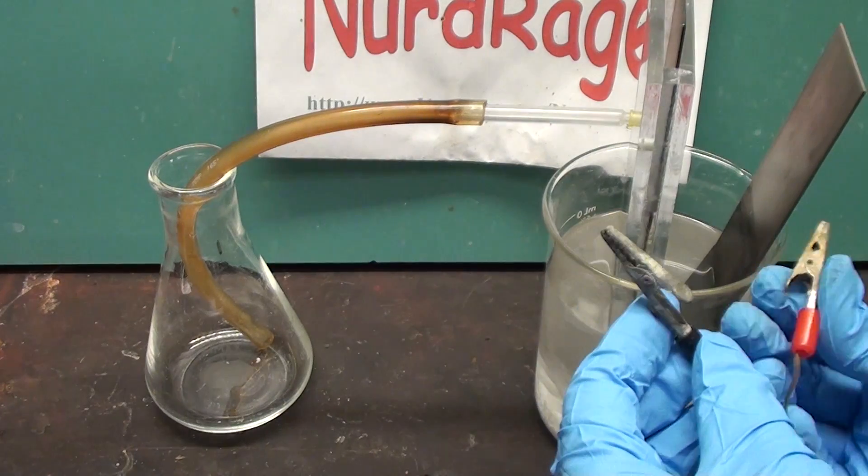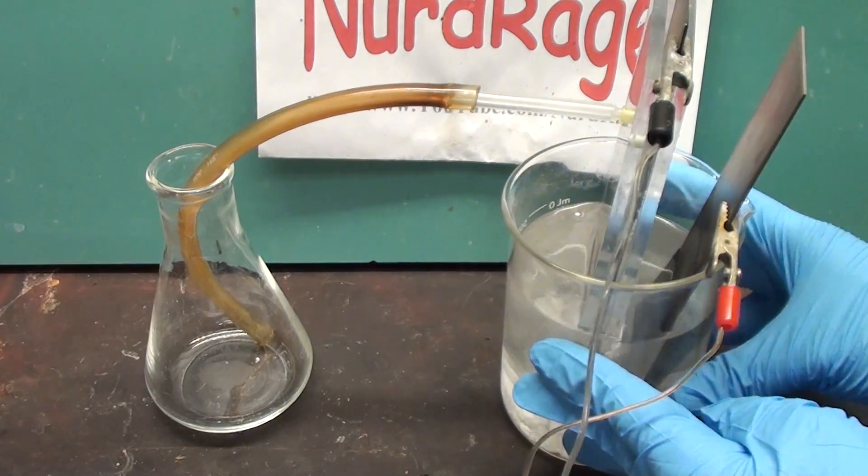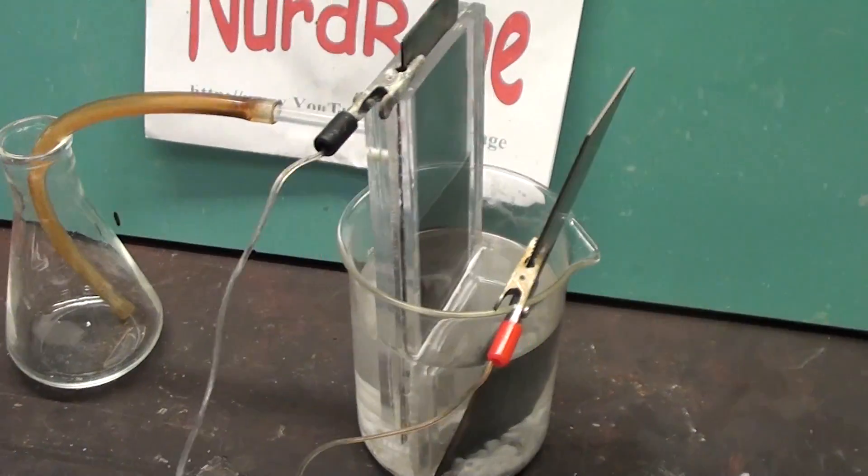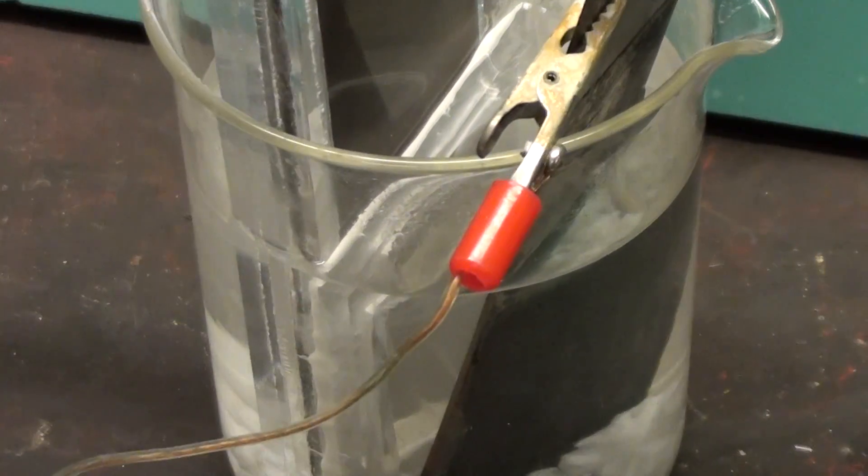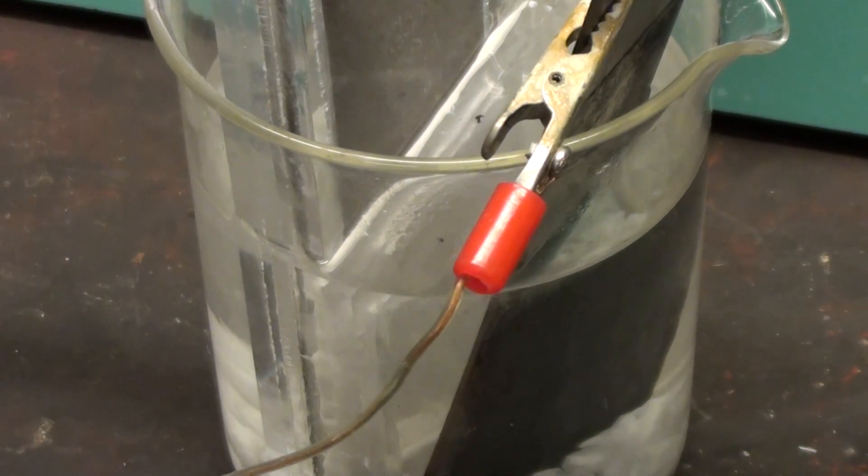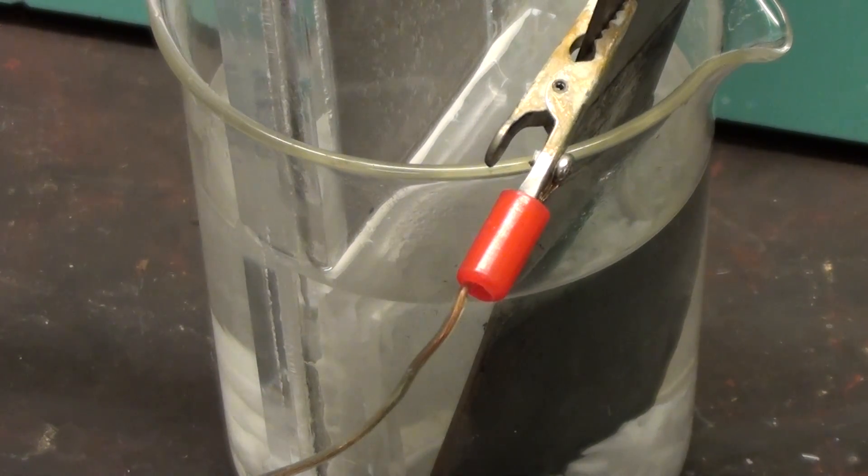Now we hook up our power clips and apply a current. The cathode is the titanium electrode inside the inner compartment and the anode is the cobalt oxide coated titanium electrode in the outer compartment with the sodium bicarbonate electrolyte. I'm applying a 1A current which corresponds to a 40mA per square centimeter current density. And there it goes.